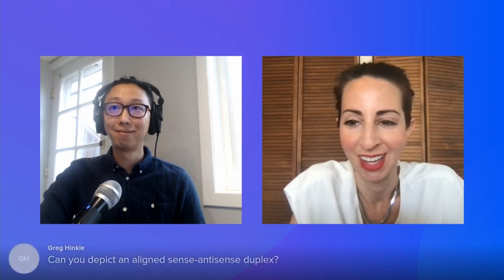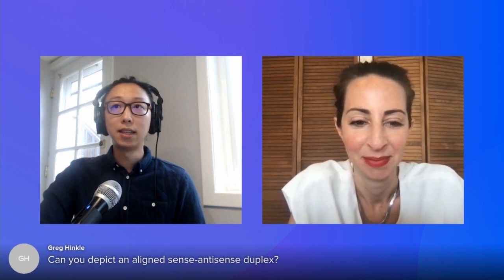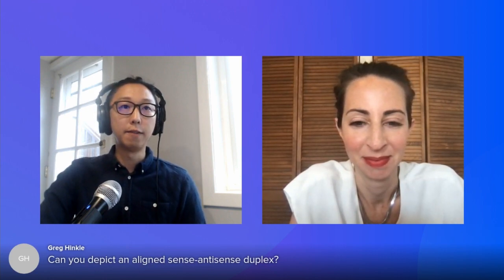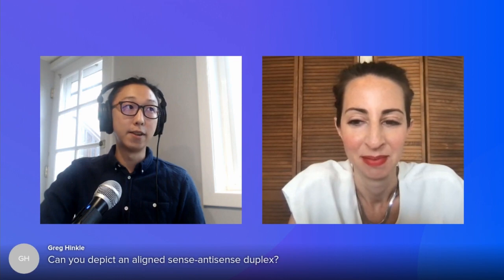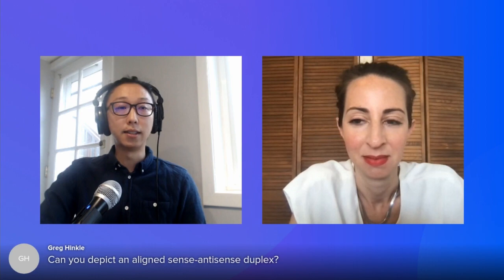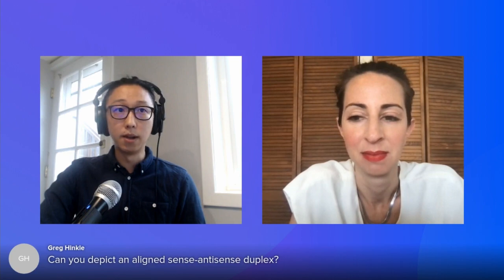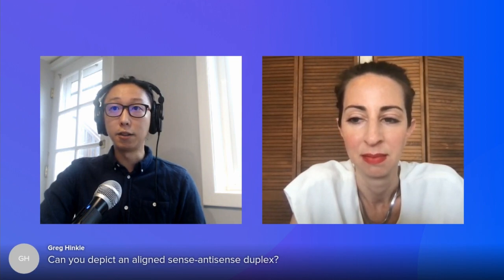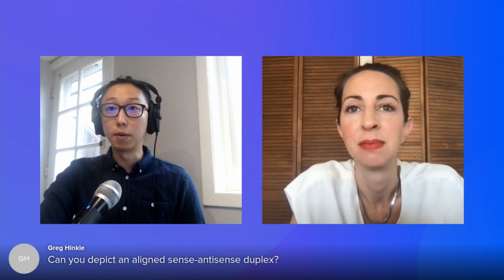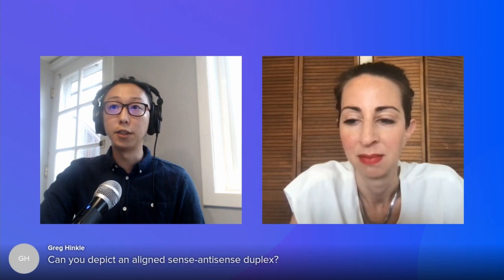Greg has a question that might be a little bit of a fun tech challenge for us. On the fly, can you depict an aligned sense and antisense duplex? Yeah, that's definitely a great question. What I've shown today is really foundational in that we are now able to store modifications on a single strand of either DNA or RNA nucleotides. And so this, I think, also relates to another question we have down the bottom from Johan about supporting additional Helm data types like ADCs.